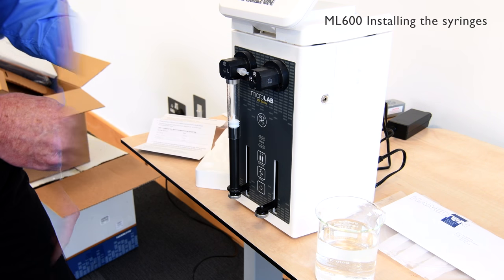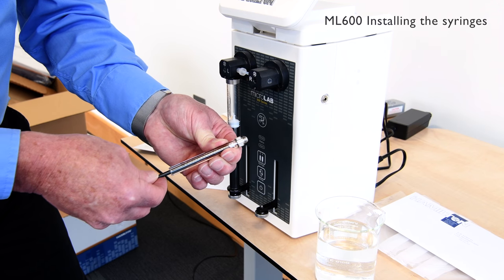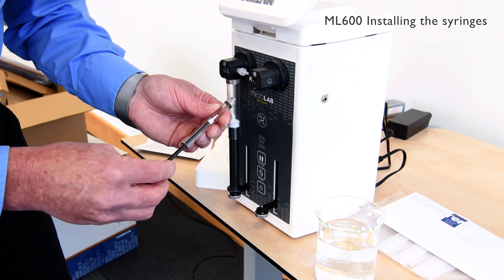We're now repeating this exercise with the one mil syringe, getting smooth movement of the plunger in the barrel. And now we can secure it to the valve.